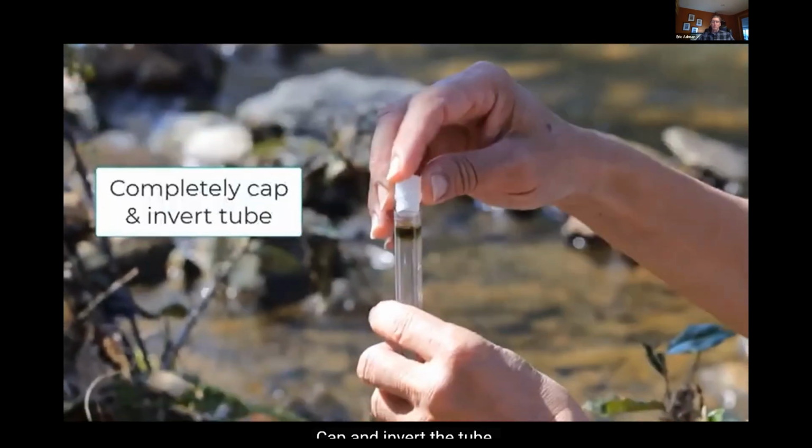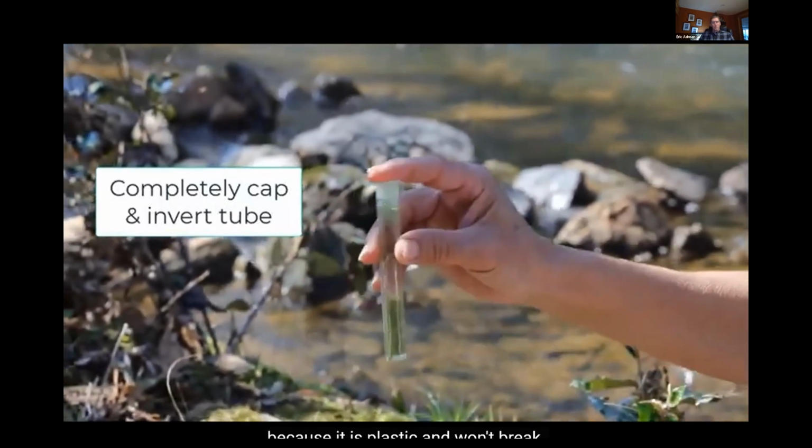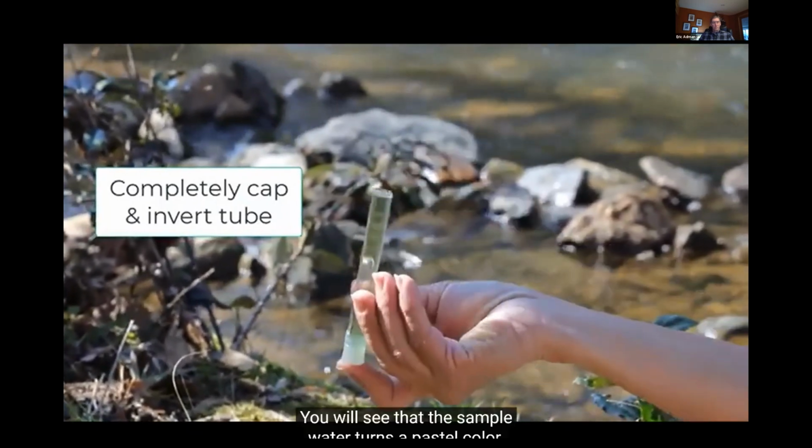Cap and invert the tube. You can cap this tube completely because it is plastic and won't break. Invert 3 times to mix. You will see that the sample water turns a pastel color.